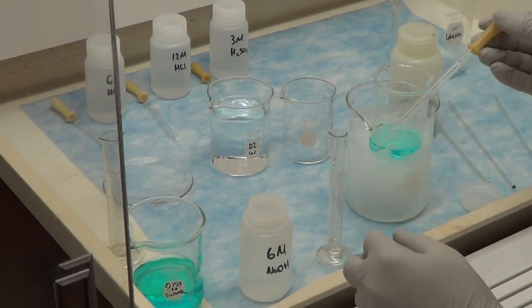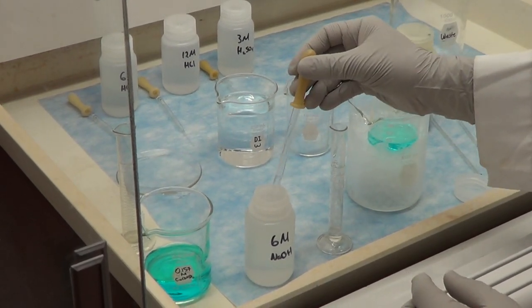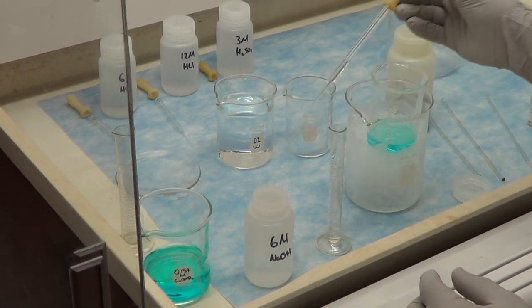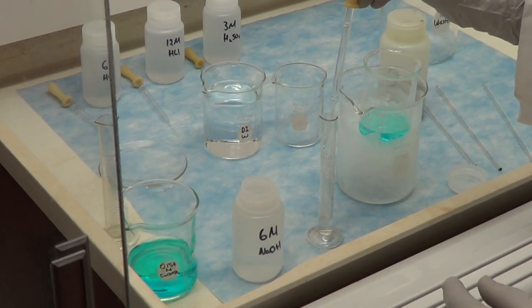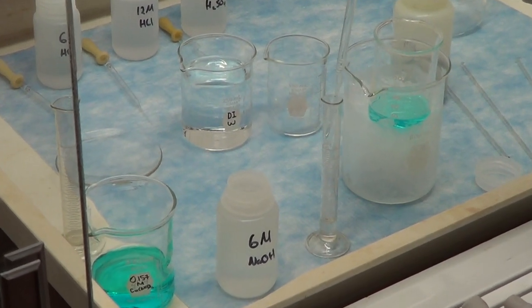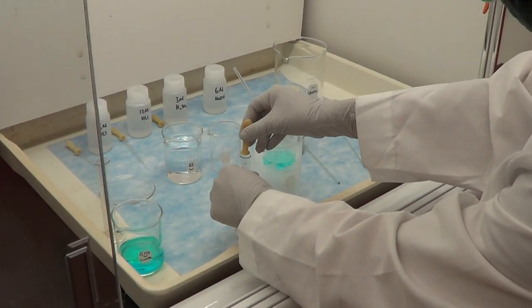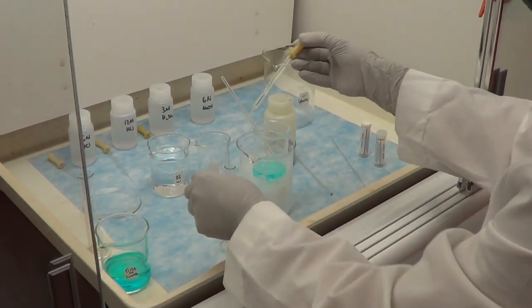We will then measure 2 ml of 6 molar sodium hydroxide solution using a graduated cylinder and add it dropwise with constant stirring to the copper nitrate solution. We will observe the change in color from light green to blue and then dark blue.